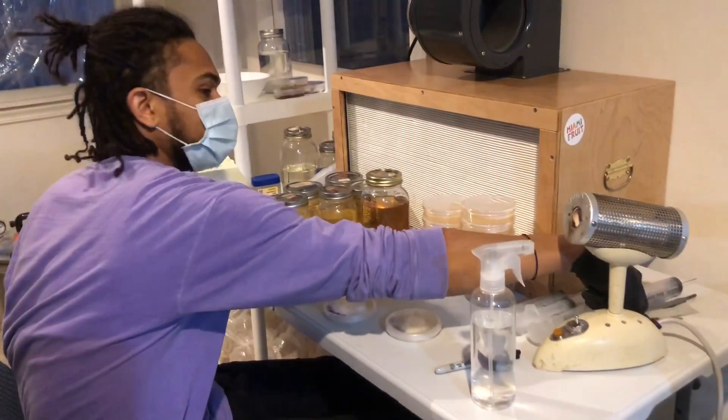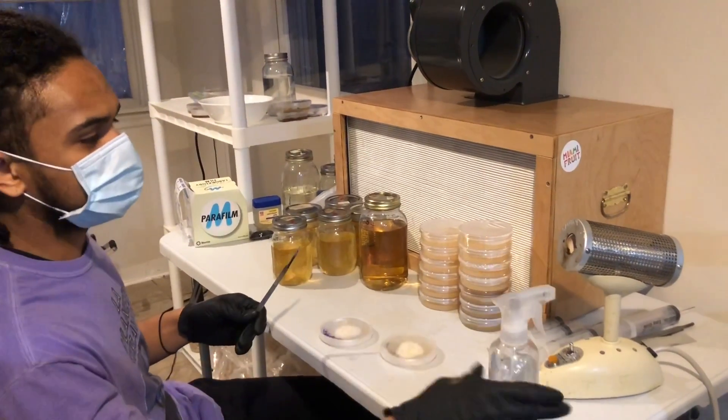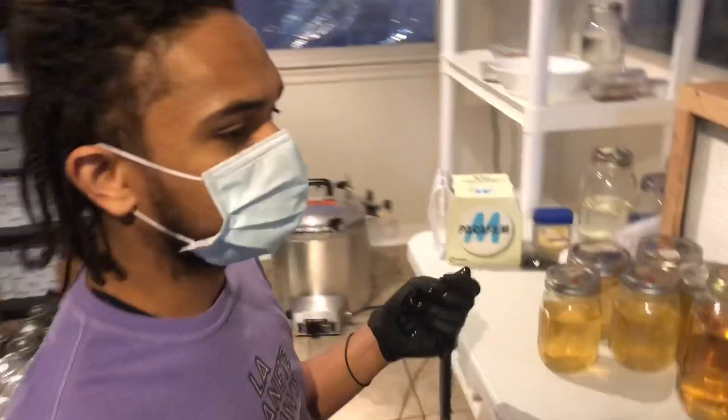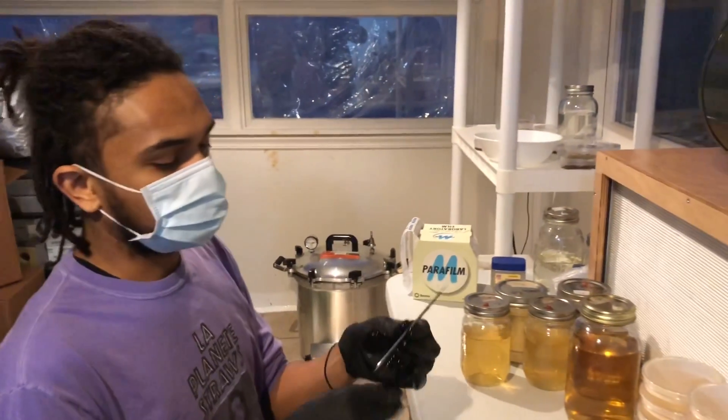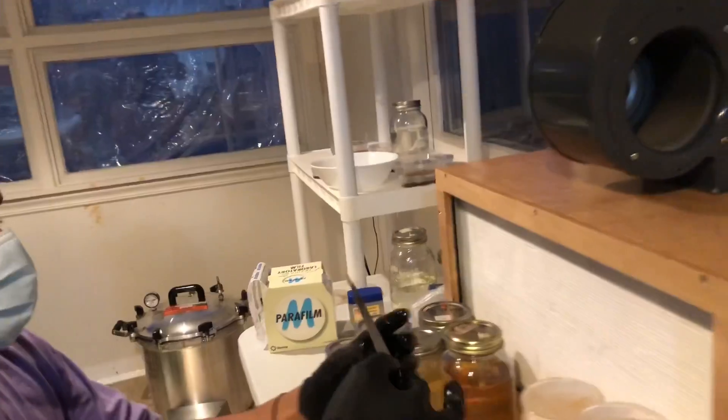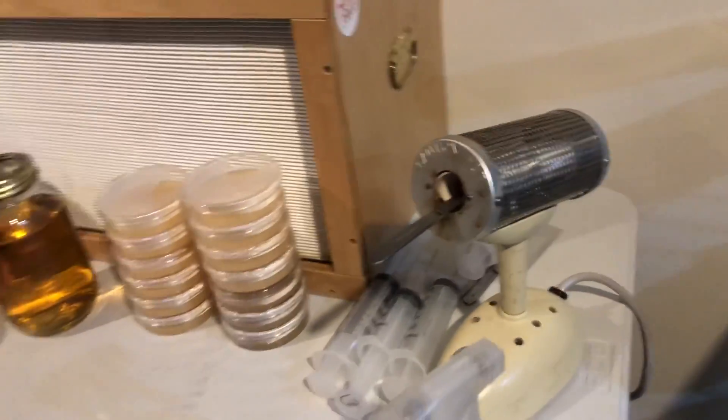I'm going to get started using this back-decinerator that I got on eBay, super cheap. You can get back-decinerators used for not that expensive at all. I sprayed a little bit of alcohol on the blade handle and I'm going to let that evaporate off a little bit before I stick it into the back-decinerator so I don't cause any flames.